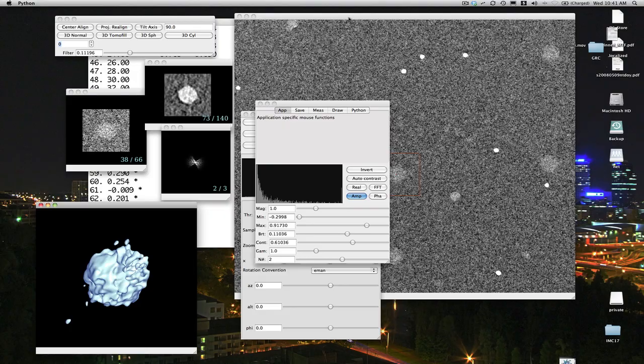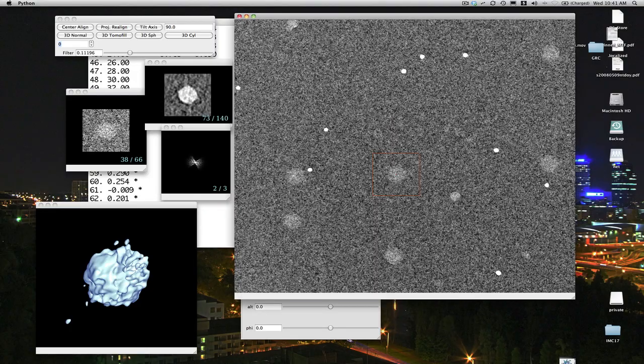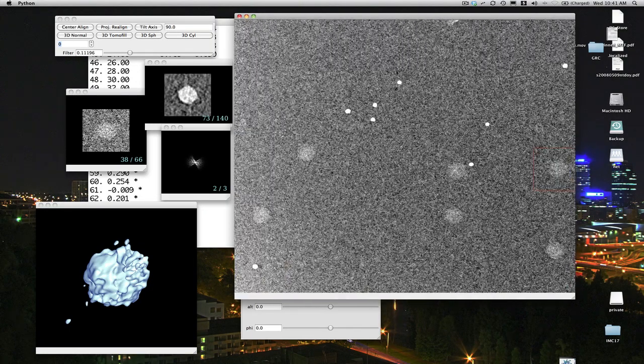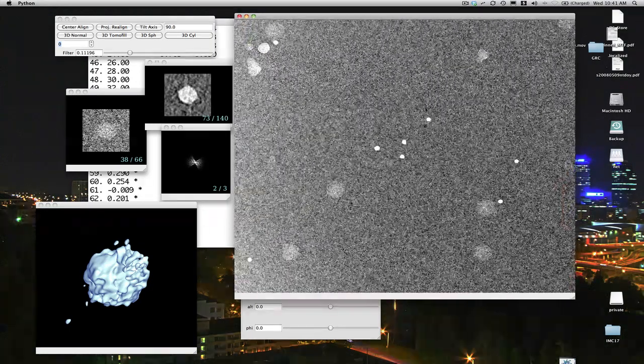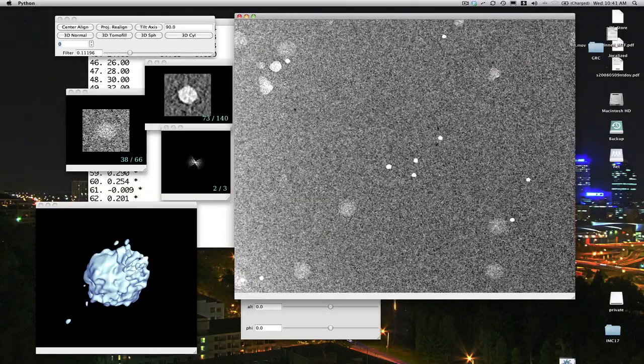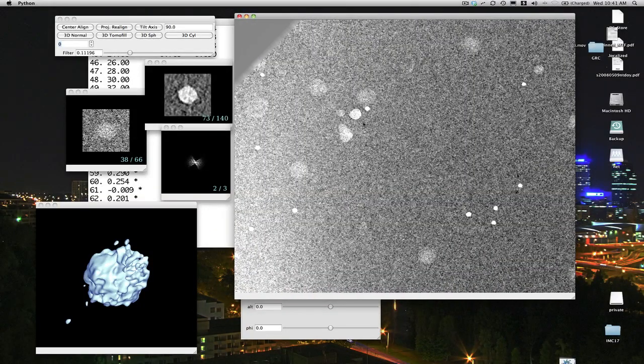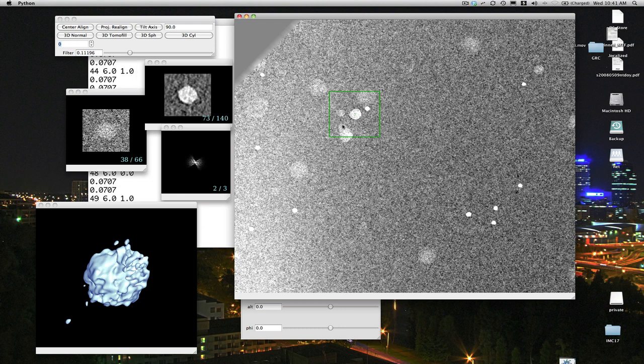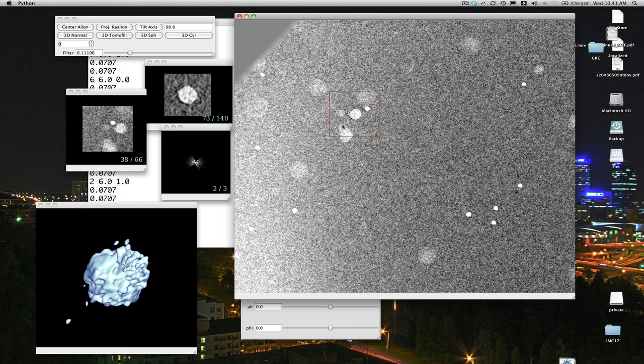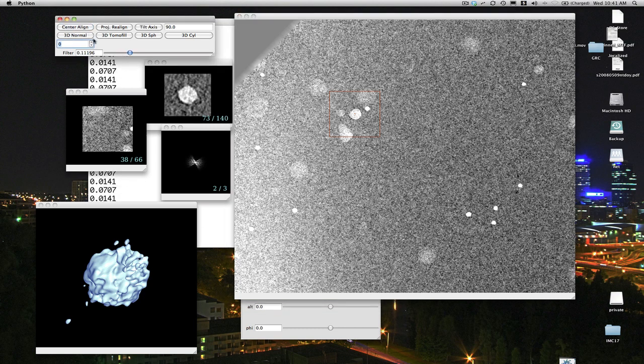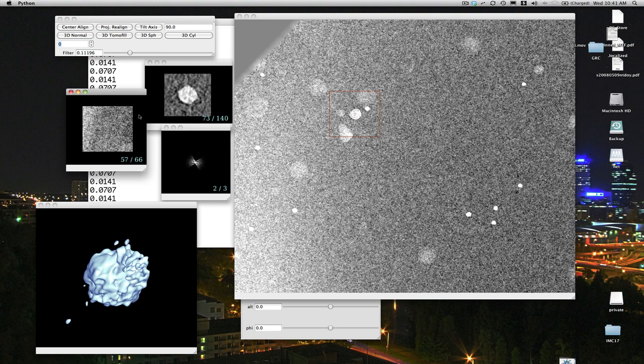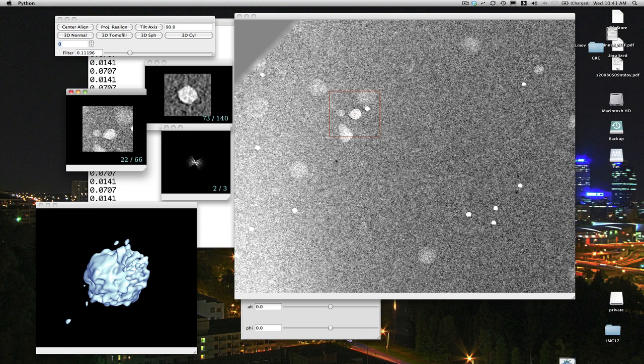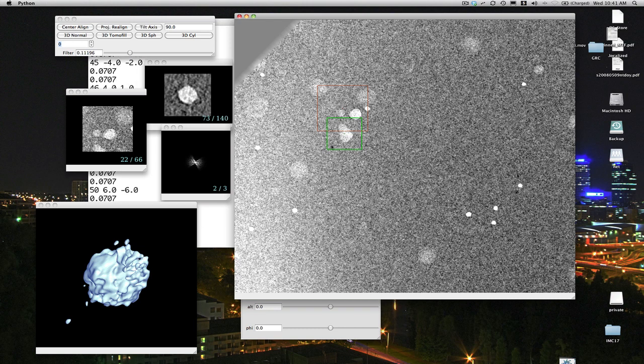And that's about it. If you want to click on another region of the reconstructions, you know, say I want to reconstruct this set of blobs here, for example, I just grab another box, and we'll see here, I can probably try my center alignment again, although it may shift it in a direction where I don't want it to go, because it really is looking for sort of one well-defined object in the center. Let's try a different one. Let's try this. Let's see how we do with that.